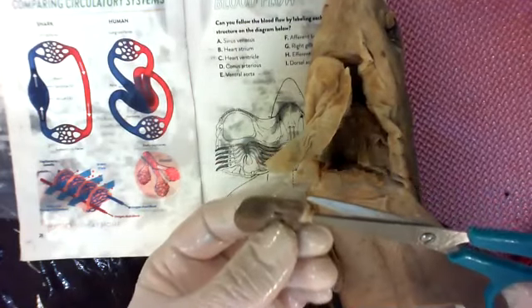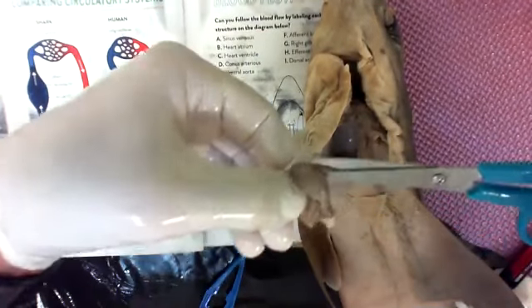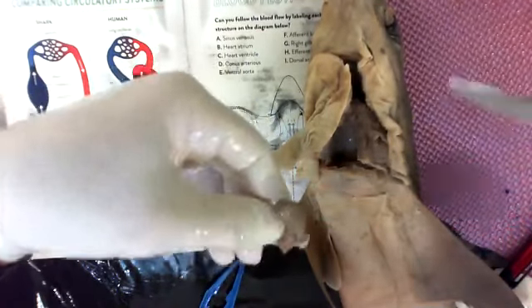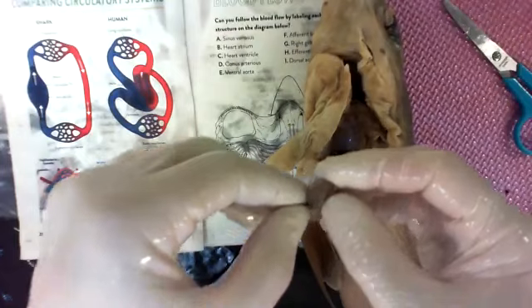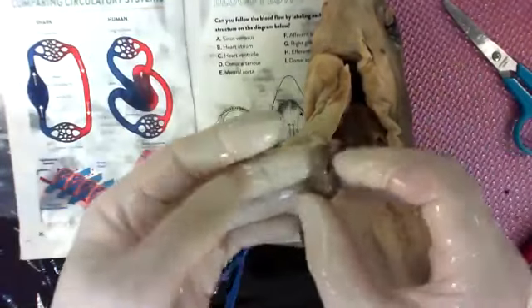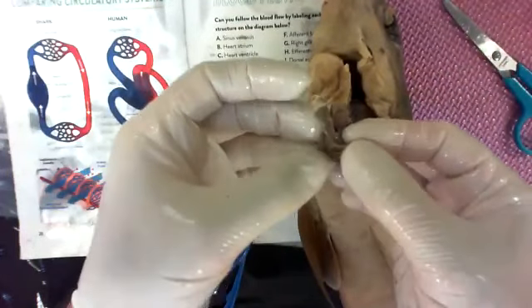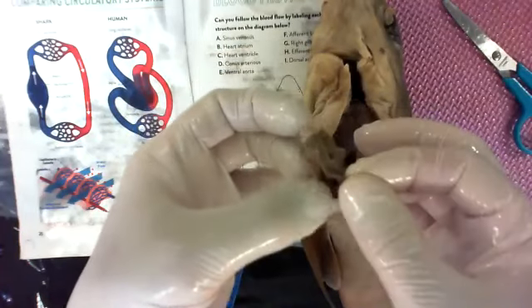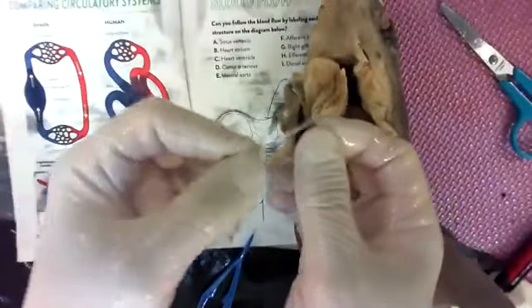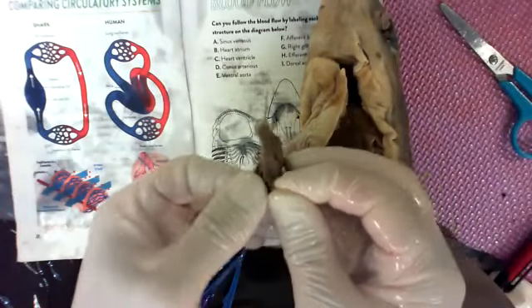So I started here. I went into the top of the aorta. I snipped, I snipped, I snipped. I'm coming around, snip, snip, snip, snip. And now I should be opened. Yeah. All right, so here we're at the front. Let's open it up book style. Cool. You can see the inside of the ventricle. See it in there, the pocket? I can see the pathway. I'm gonna grab a pen. So I can see the pathway where blood leaves through the aorta, goes up this way, and then blasts out the top.